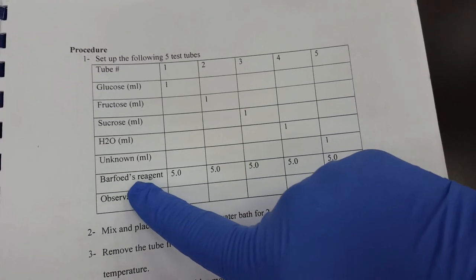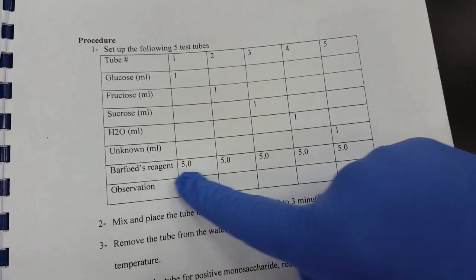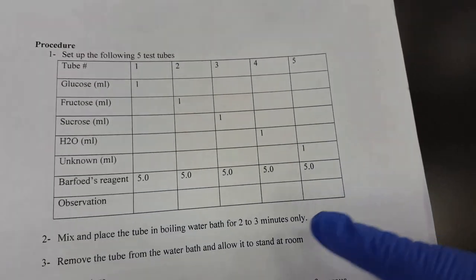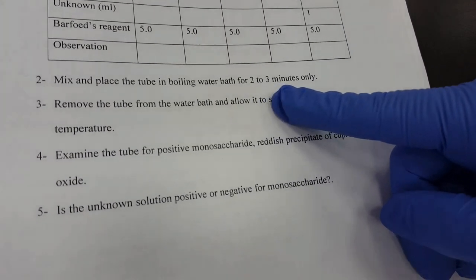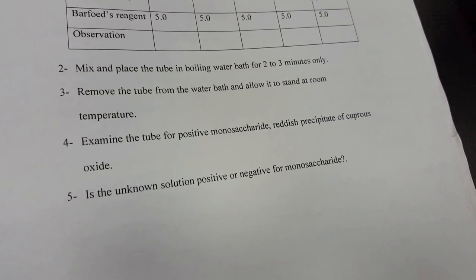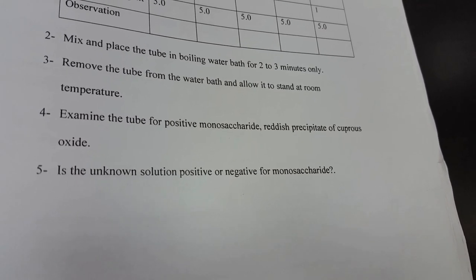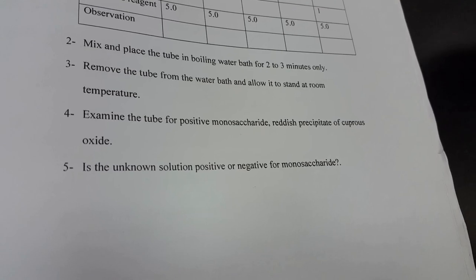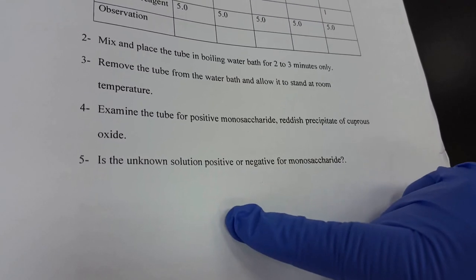After you add 1 mL of the sample, you have to add 5 mL of the reagent. Then mix your tubes and heat them for around 2 to 3 minutes maximum in the boiling water. We take them out after this incubation, let them sit at room temperature, and examine for positive monosaccharides. If it's positive, it will form a reddish precipitate of copper oxide.